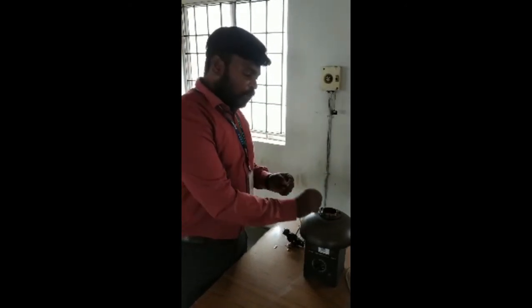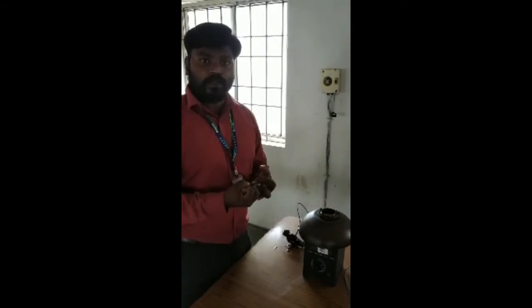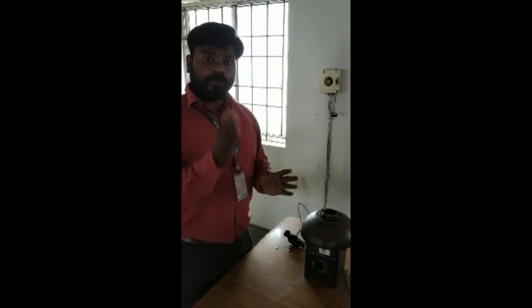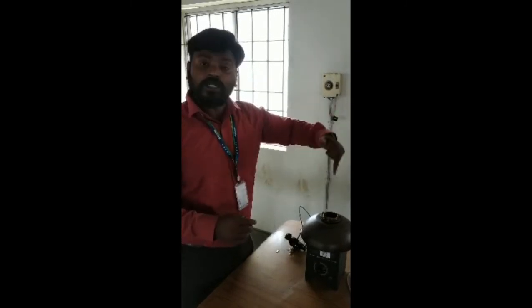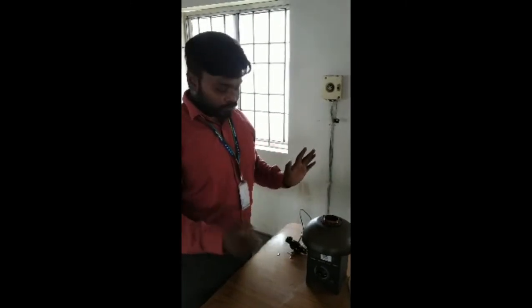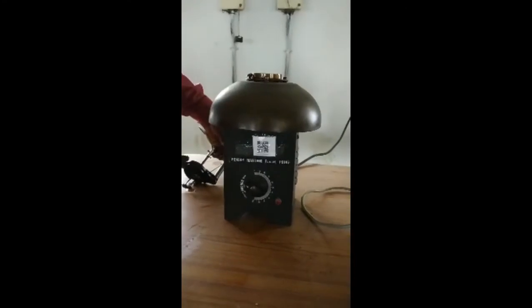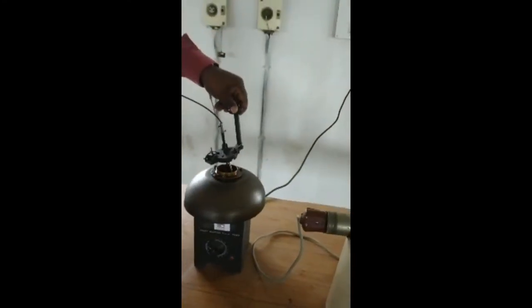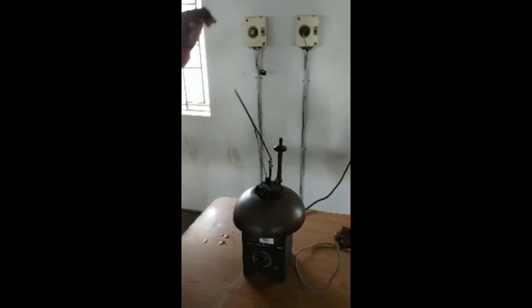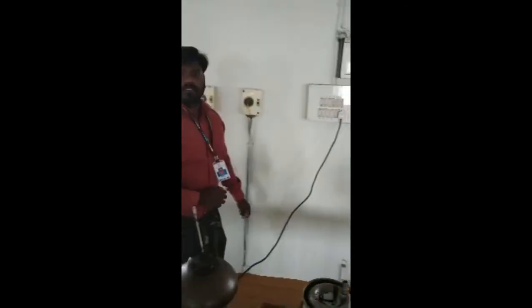Again, you have to keep placing the matchstick until the fuel catches fire. Once it catches fire, that particular point is nothing but the fire point, and you have to note down the reading with the help of the thermometer. Once the experiment is over, you have to turn it off, place the lid properly, and switch off the apparatus like this. Okay, thank you.